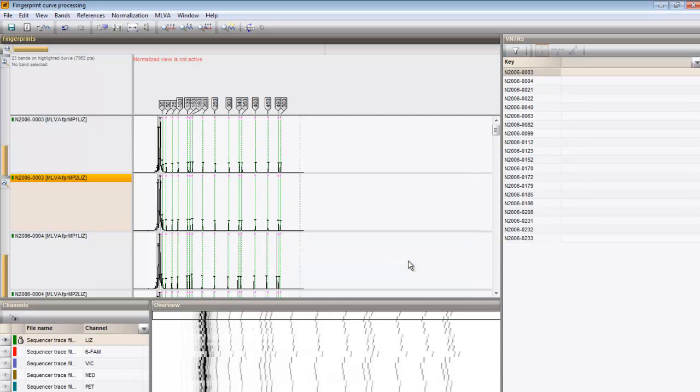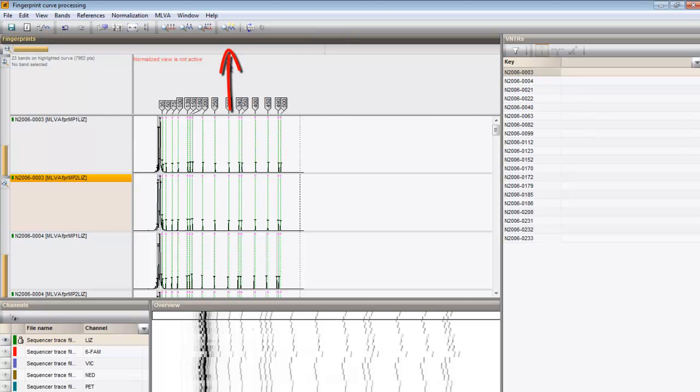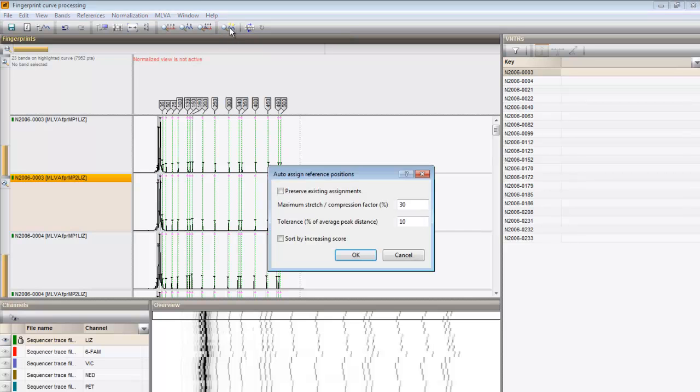To normalize a complete run at once, press Auto-assign reference positions, All lanes. I leave the settings unaltered and I press OK.